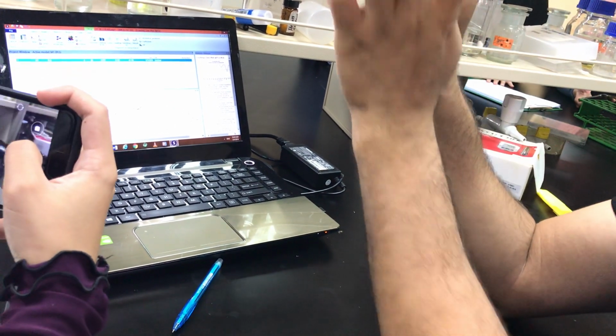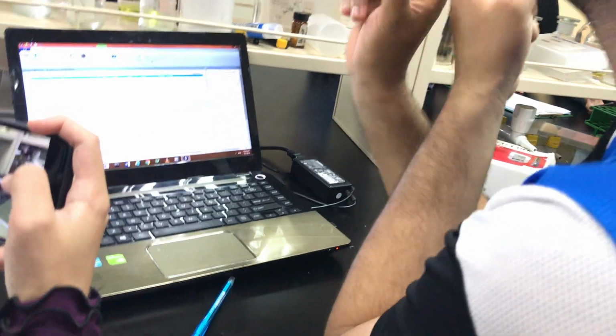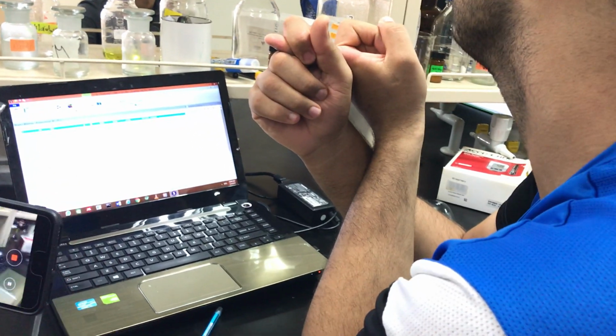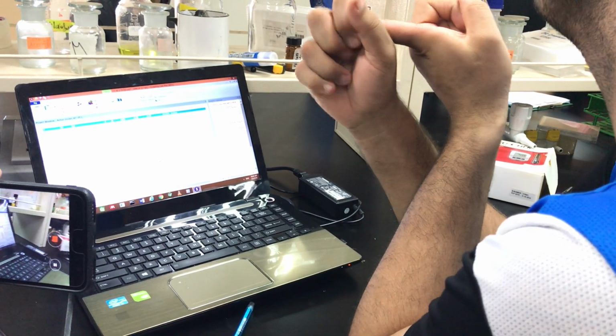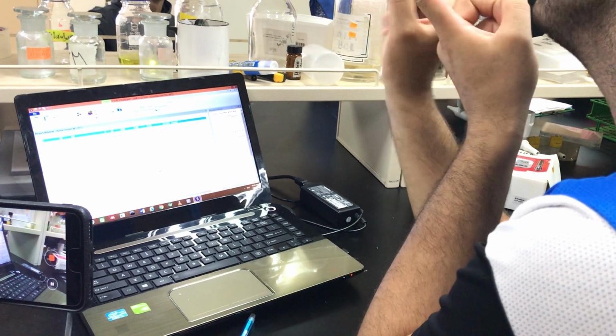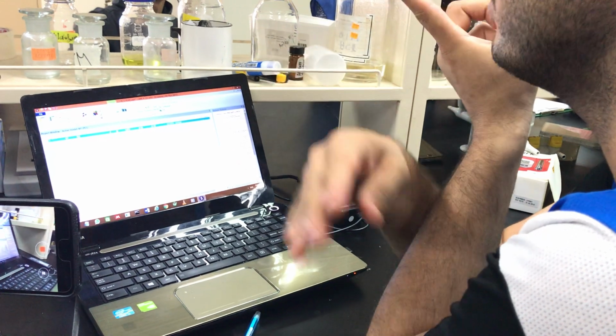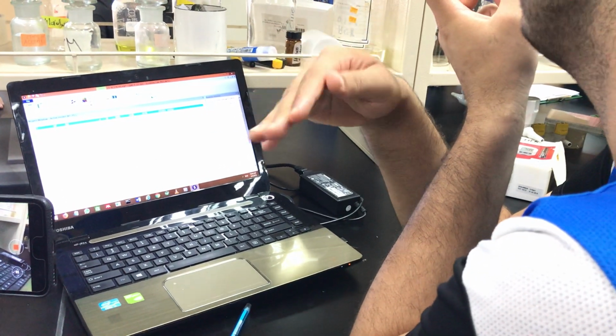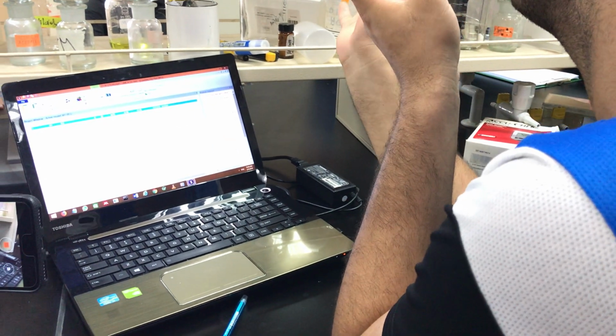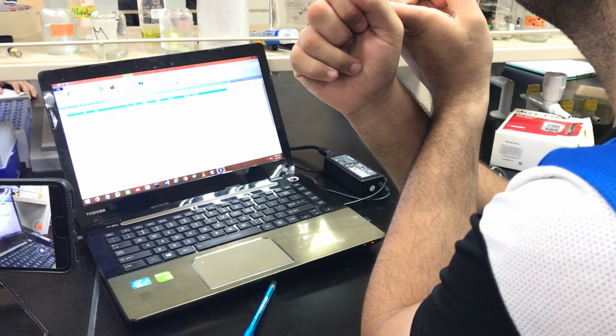Yes, the first reason in your report is that all the extracts show high activity. There is no significant difference among the inhibition percentage among all the extracts from 0 until 100%. 0 ethanol, meaning 100% water, until 100% ethanol, all showing high activity.